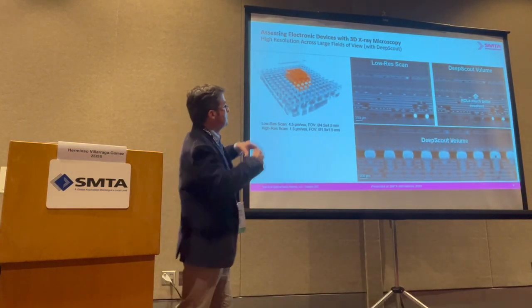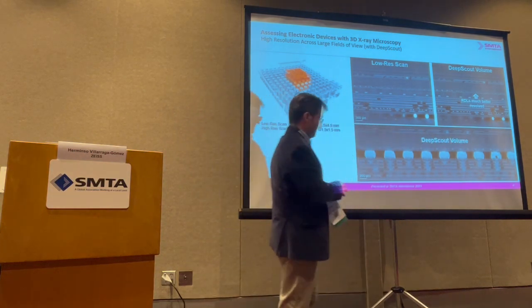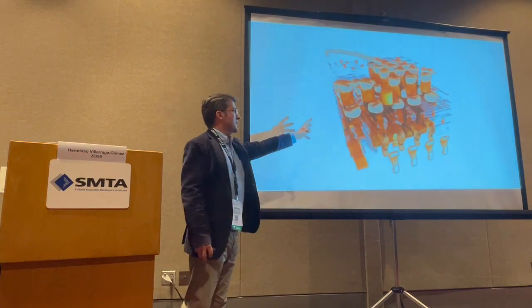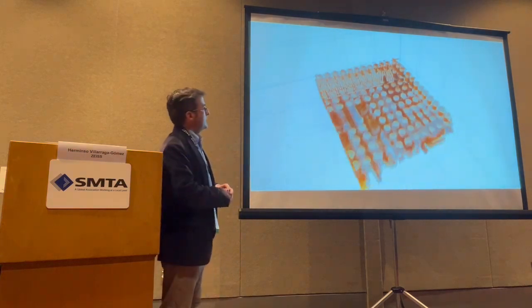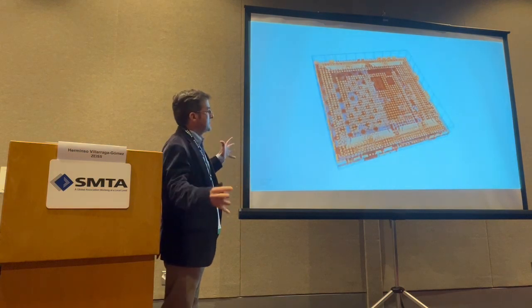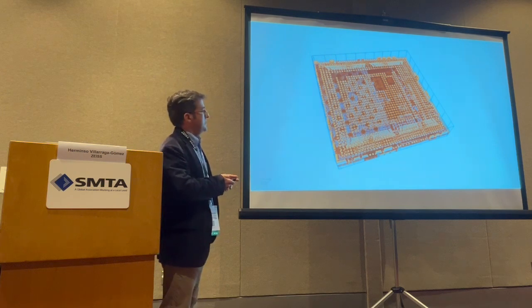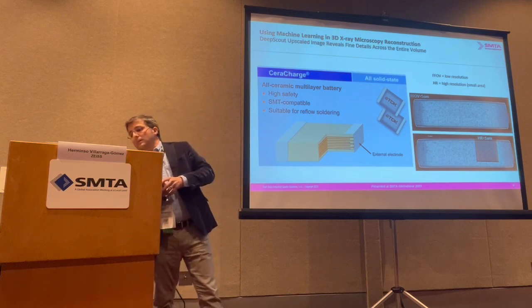And when you apply that to the full field of view, then this is what you get. And I think I have a video of that to give you an idea of what happened in the volume. This is a high resolution scan that is being used for deep learning training, and then once you get it, you apply it to a low resolution scan of the full field of view, and then you get improvement in image quality. I'll give you a second example.